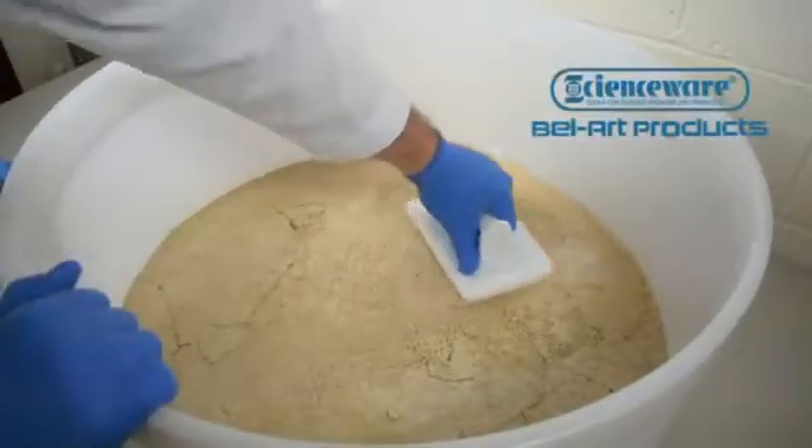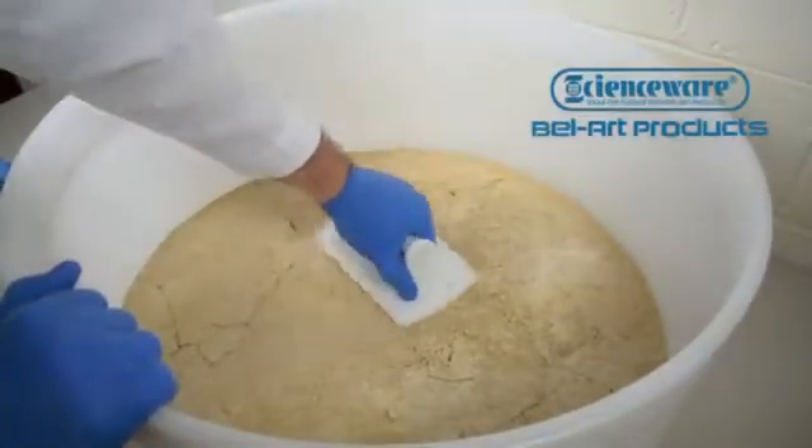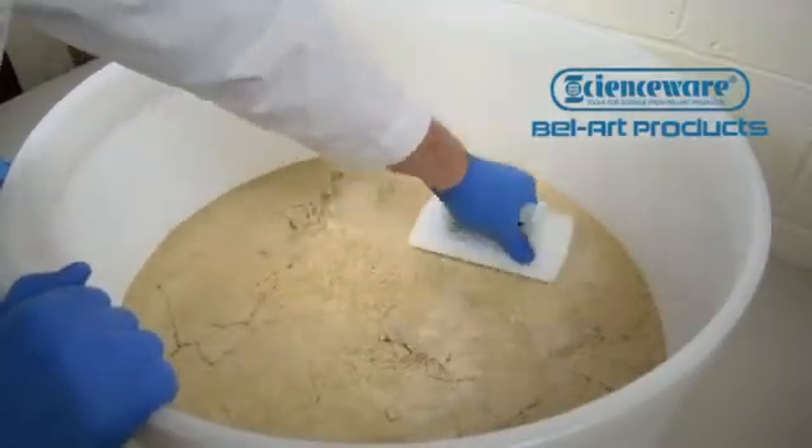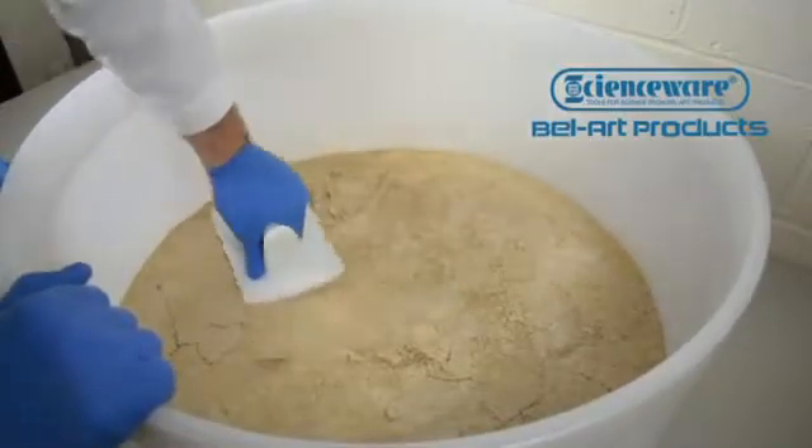Beveled edges on both sides allow surface smoothing action in both left-to-right and right-to-left sweeps, and the ends have a slight arc to better match the curved sidewalls inside the Buechner funnel.